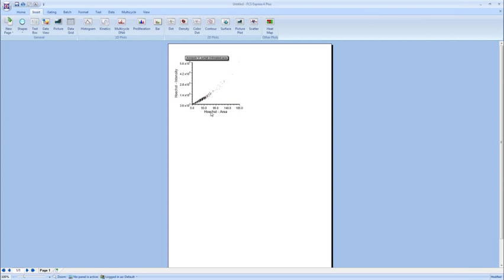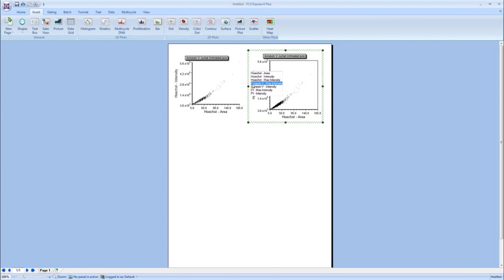Any of the parameters that you've stored with this file, if I click on the axis, they're all available here. So you notice when Henrik was acquiring data, he was acquiring the propidium iodide and Annexin-5 channels. Those are all here for us to choose if we'd like. And say if we wanted to insert another plot, and we wanted to look at Annexin-5 and propidium iodide, we would just put those on the axis here. And that's how we would choose these things.